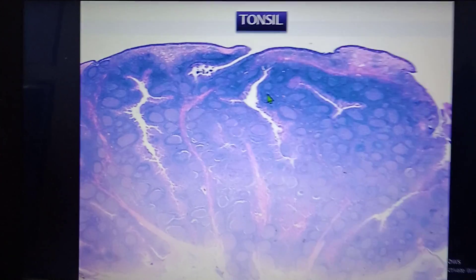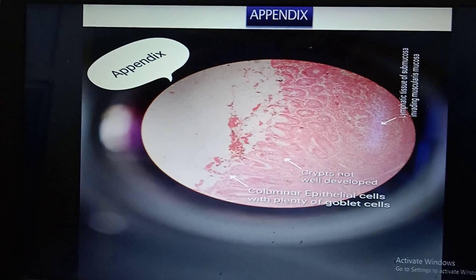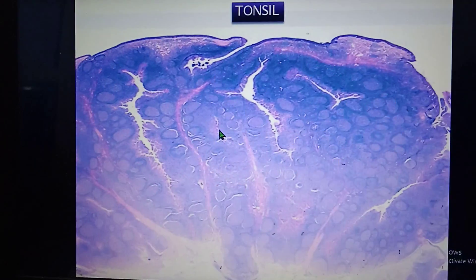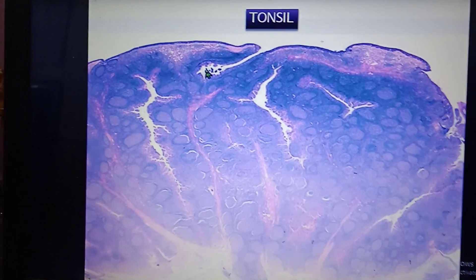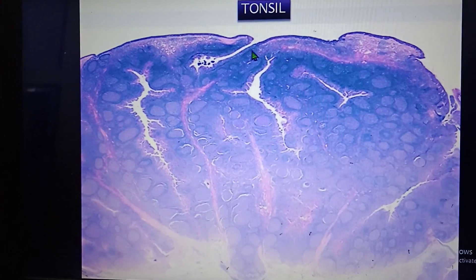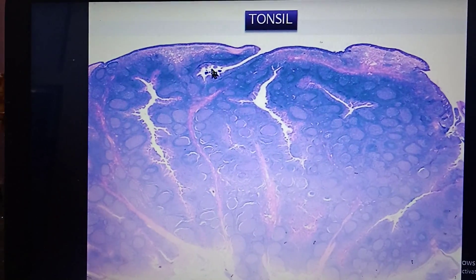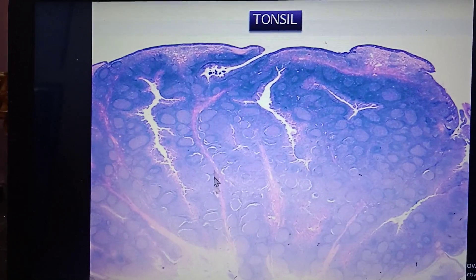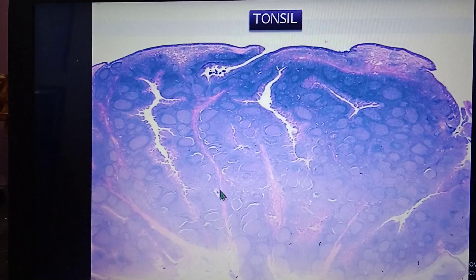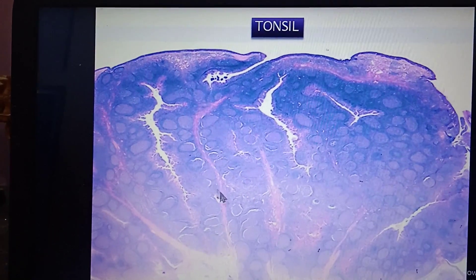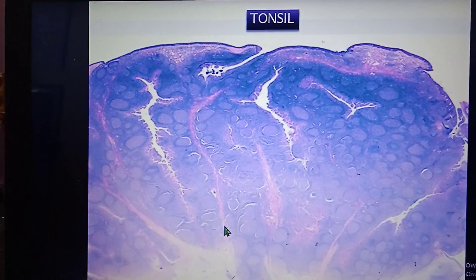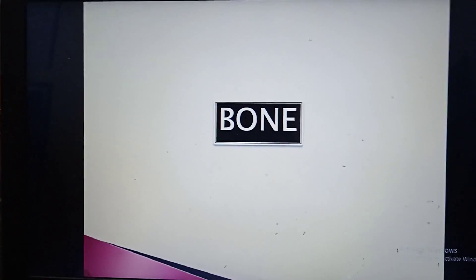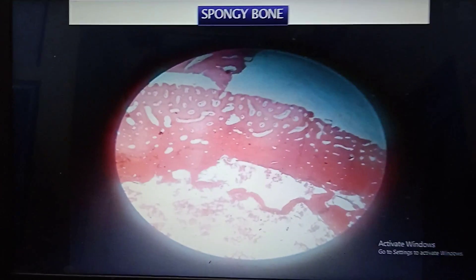The difference between appendix and tonsil: in tonsil there is an intratonsillar crypt present and the lymphoid follicles are arranged by the side of the crypts — this arrangement of lymphoid follicles is the main difference.